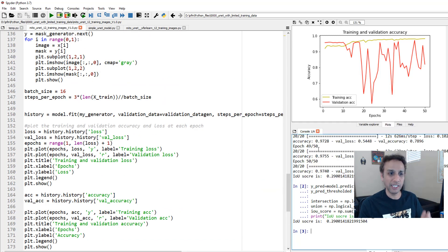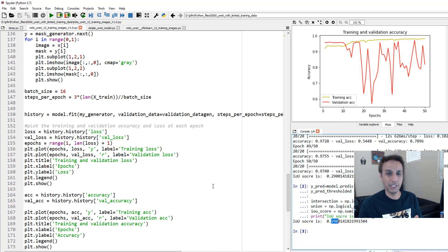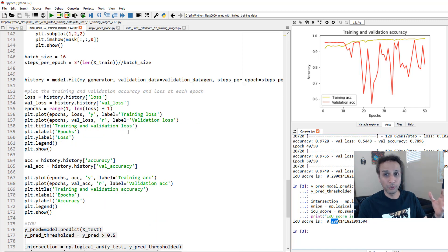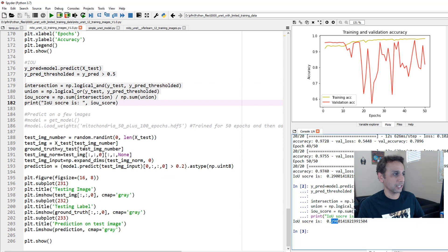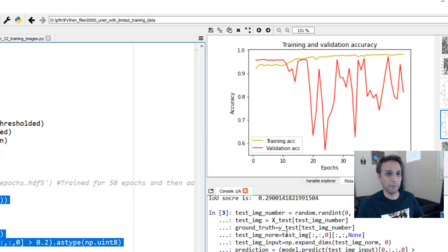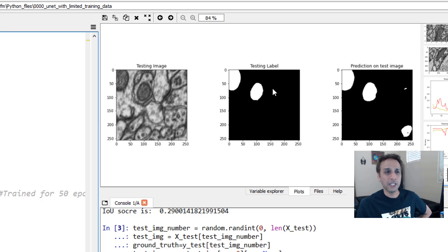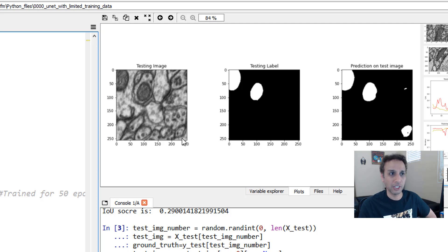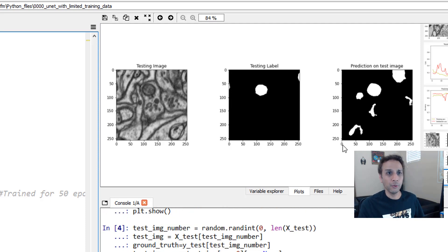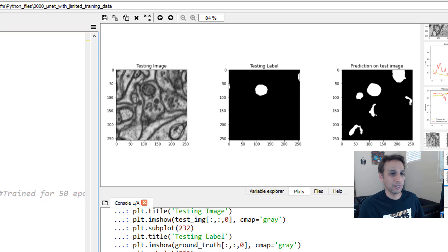With 50 steps per epoch the from-scratch U-Net gets up to about 45 to 50% IoU — but with transfer learning you're getting much better accuracy (80%) compared to starting from scratch. Looking at the from-scratch predictions, it's generating entirely wrong mitochondria that don't even exist, and there's a lot of noise that would be too much to clean up. This clearly demonstrates the advantage of transfer learning with limited data.